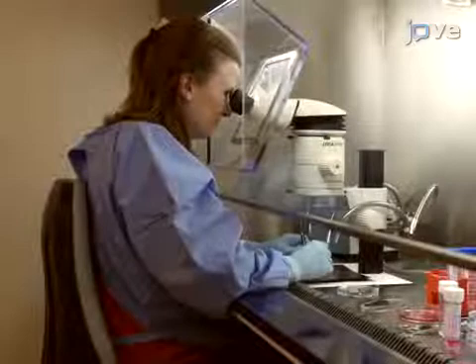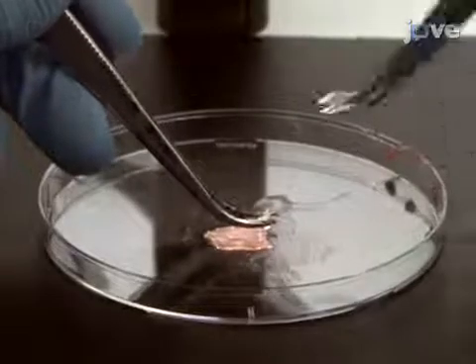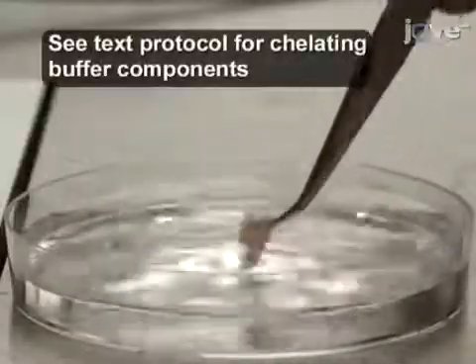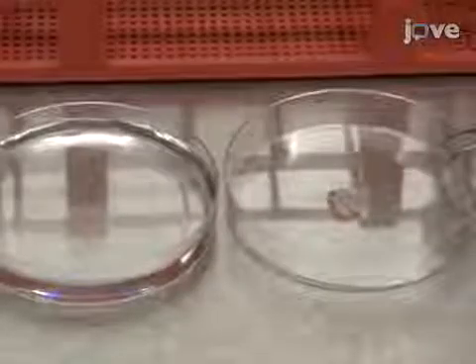Beginning with approximately one square centimeter of fresh gastric tissue in a dry 10 centimeter petri dish, use forceps to carefully remove the mucus and muscle layer. Wash the tissue in cold chelating buffer with gentle back and forth movements, then move the washed tissue to a new dry 10 centimeter dish.